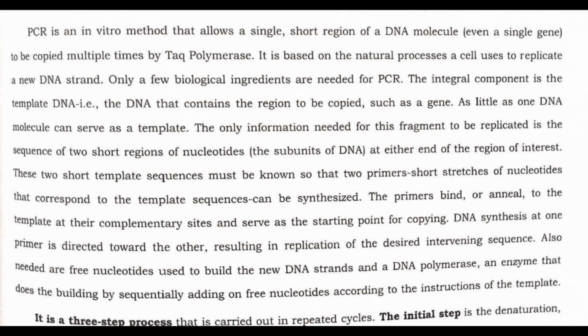The integral component is the template DNA, that is the DNA that contains the region to be copied, such as a gene. As little as one DNA molecule can serve as a template. The only information needed for this fragment to be replicated is the sequence of two short regions of nucleotides, the subunits of DNA, at either end of the region of interest.